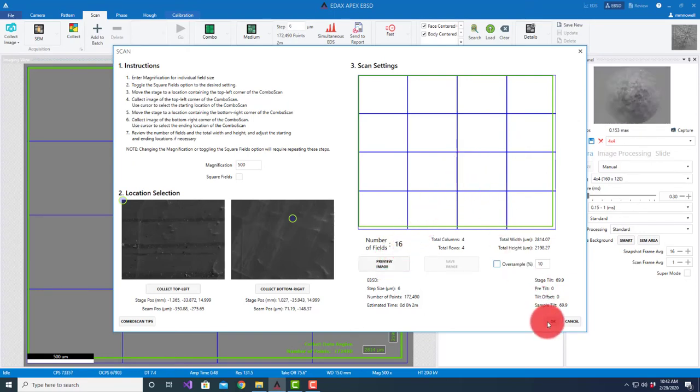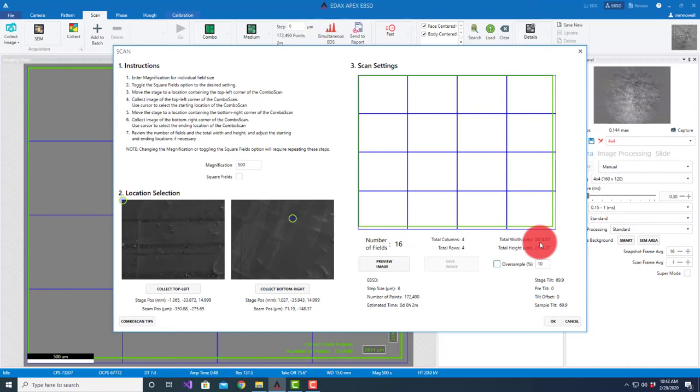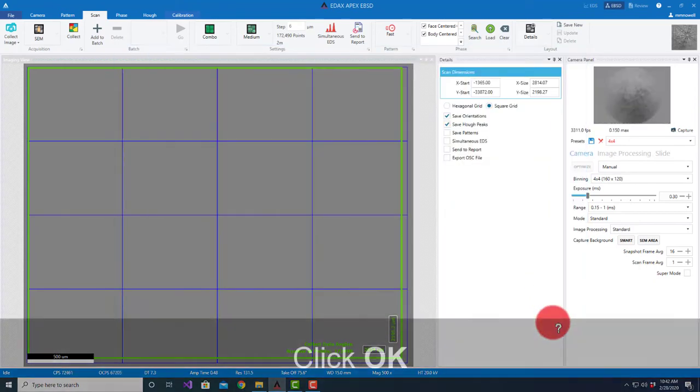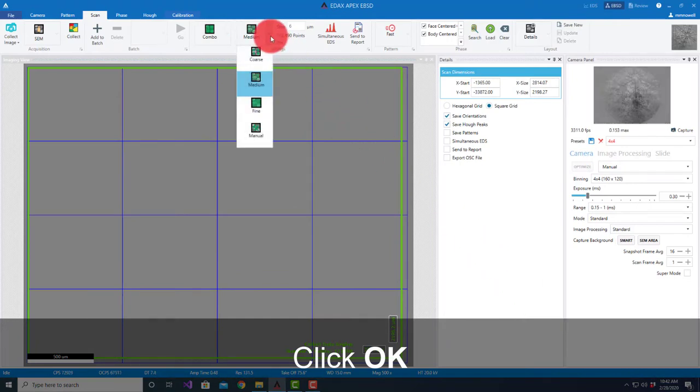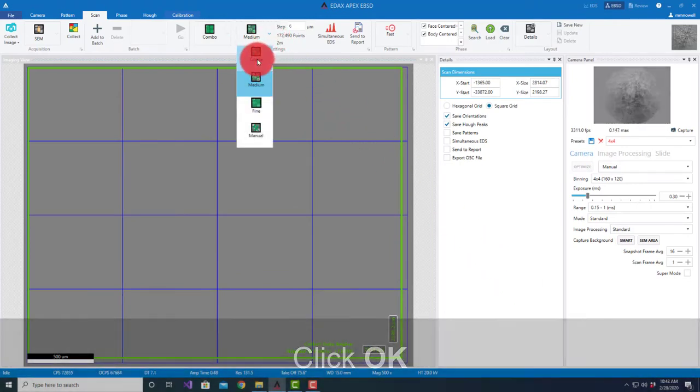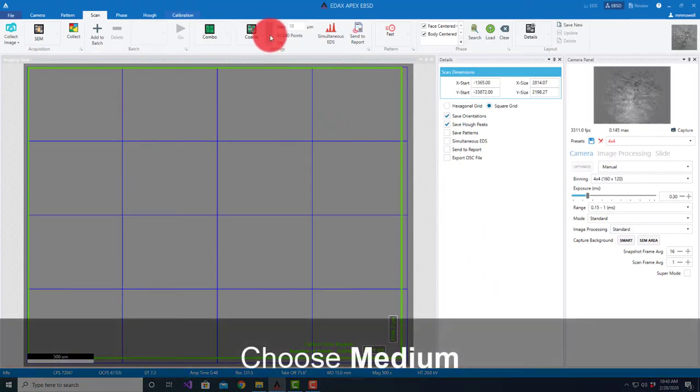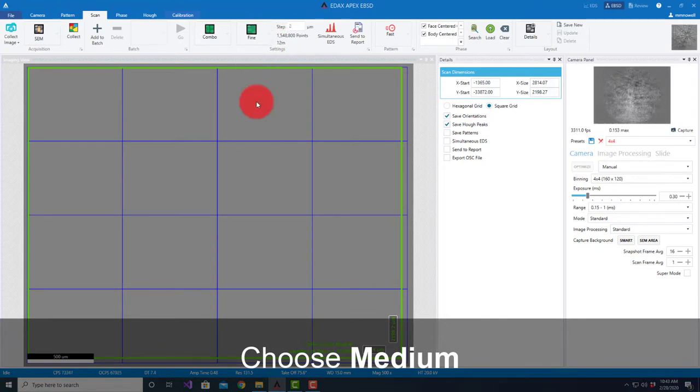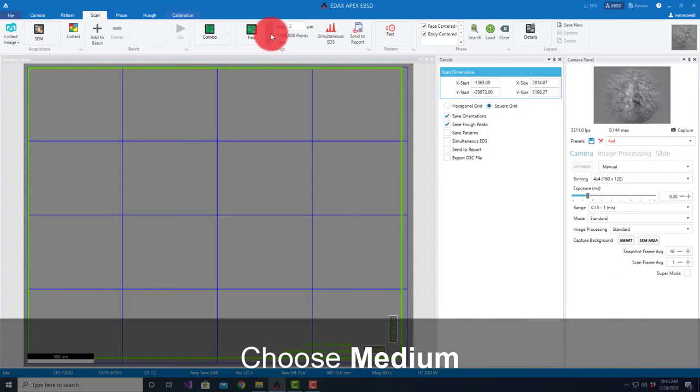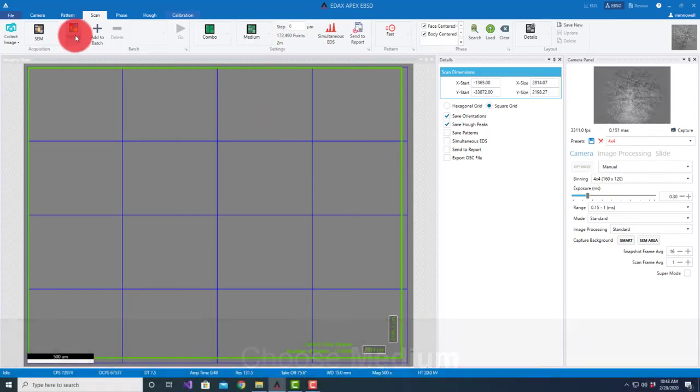I now have a 4x4 fields of view. We're going to cover 2.8 millimeters by 2.1 millimeters. We select some sort of step size. Our standard pre-tilt supply: coarse would do 10 micron steps, medium would do 6 micron steps, fine would do 2 micron steps to give us a number based on the full field of view. I'm going to select medium here.